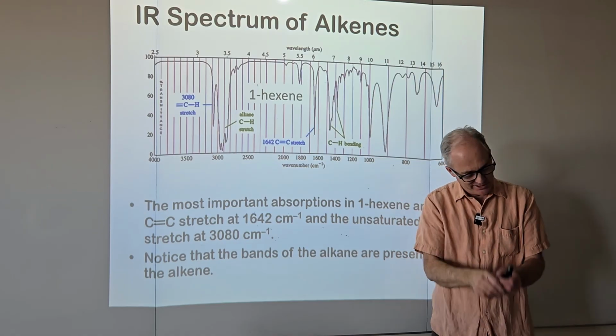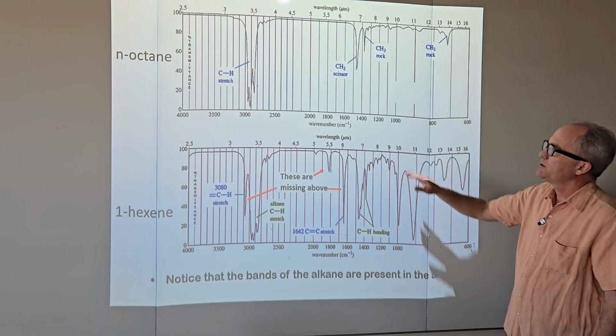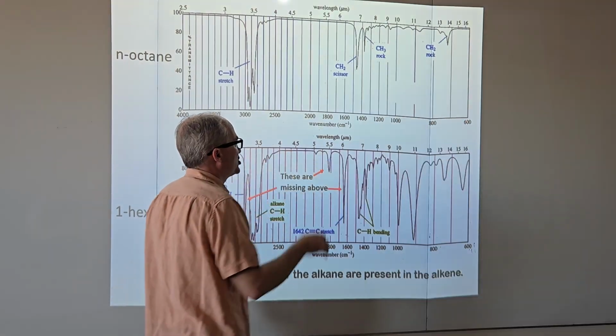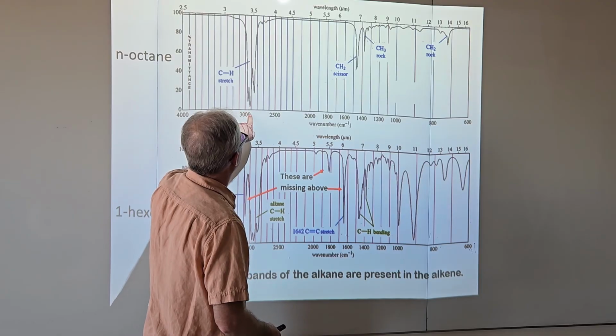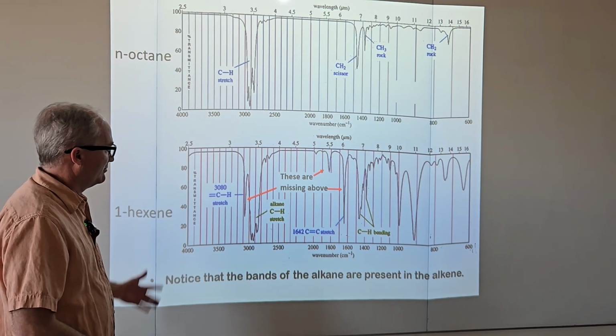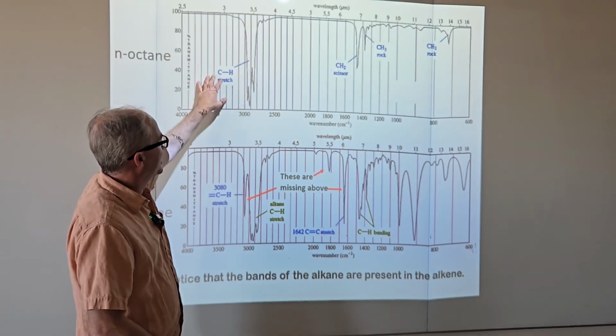It's going to tell me what the molecule is, and you try and look it up in a table, and that's kind of what we do. So here's that first one. Just a straight chain hydrocarbon. Every carbon compound has this carbon-hydrogen stretch at 2800 wave numbers. And so these peaks are missing up here.